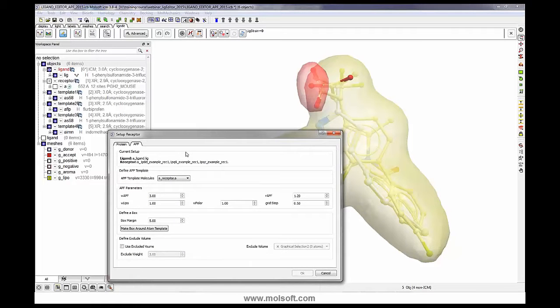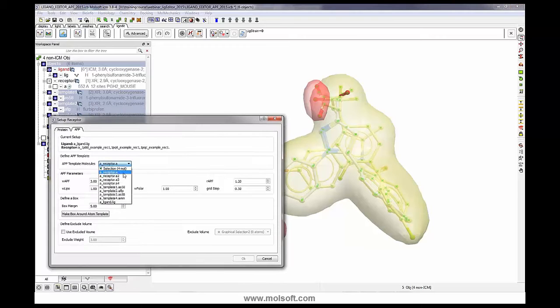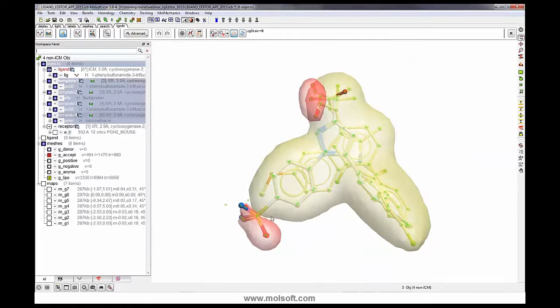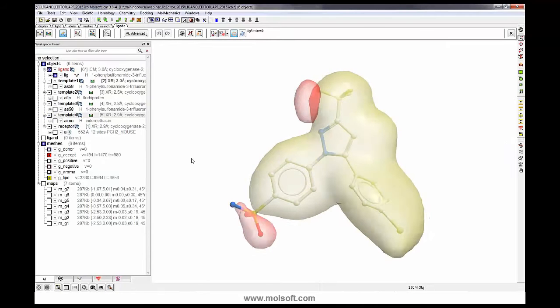This is ligand based, so we have 4 chemicals in our fields, and we choose selection of 4. Make box around these fields. Okay, so now we can just edit the ligand in a similar way as before.